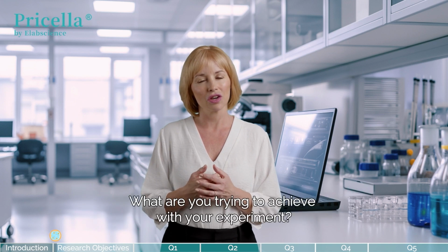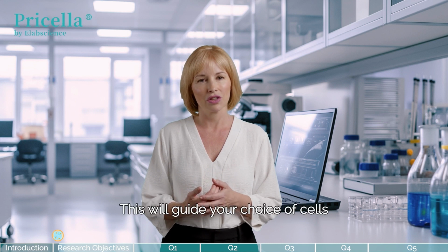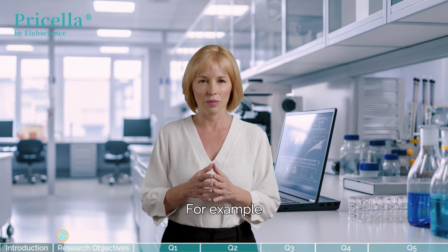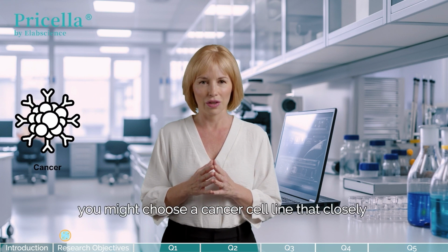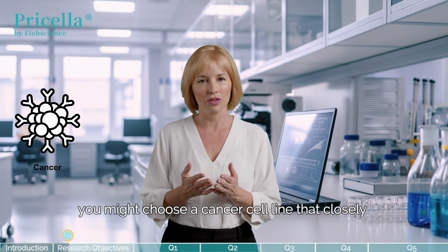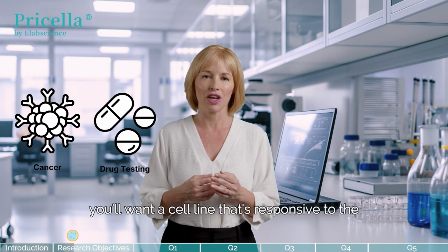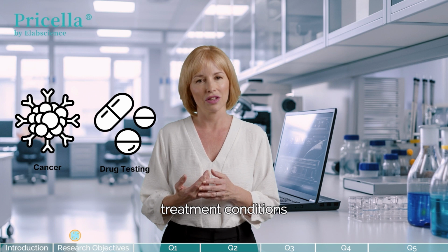What are you trying to achieve with your experiment? This will guide your choice of cells, making sure they align with your study's goals. For example, if you're studying cancer, you might choose a cancer cell line that closely mimics the tumor you're studying. If you're testing drugs, you'll want a cell line that's responsive to the treatment conditions.